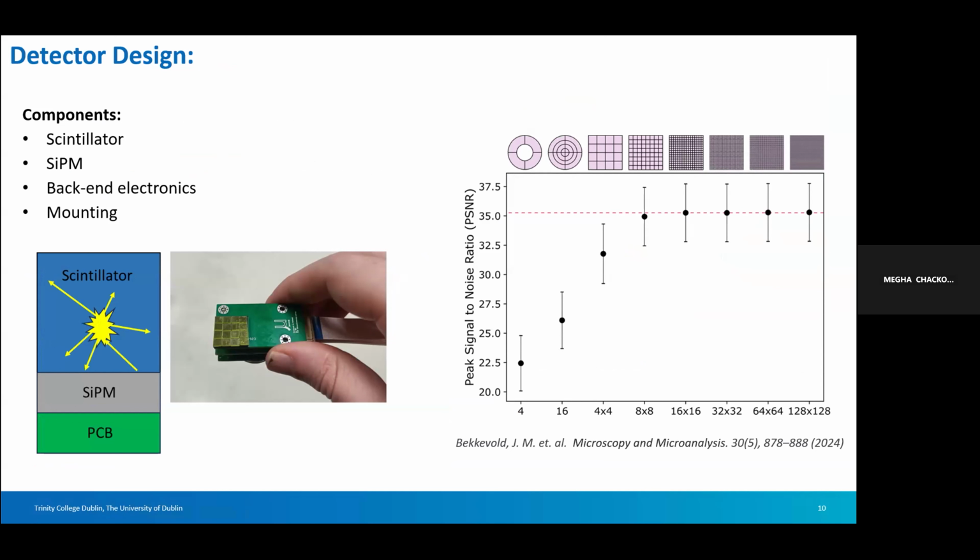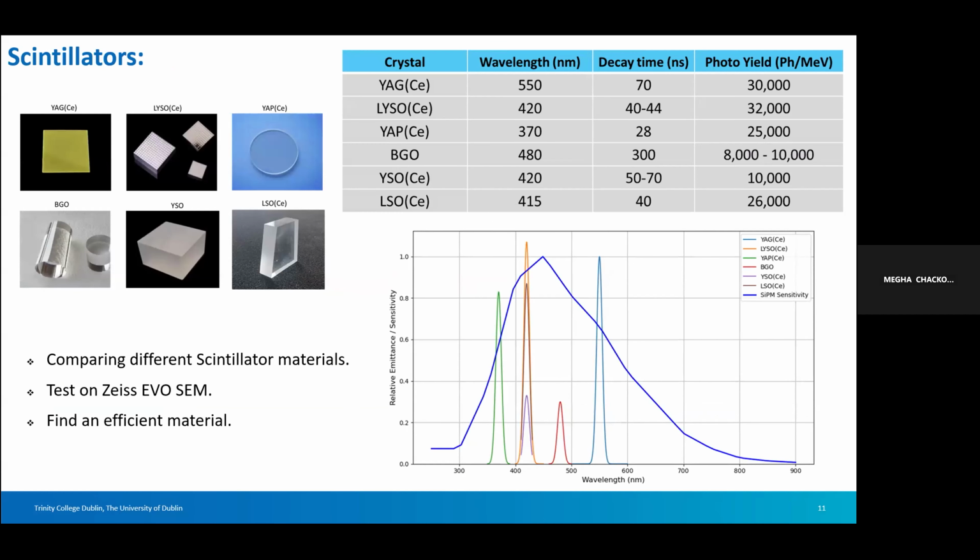Along with the low cost, we also have to consider high-speed detection. So how can I achieve that? As I mentioned, I will be using scintillator-based detectors. For scintillator-based detectors, I have to choose the most efficient scintillator, and I also have to use a silicon photomultiplier for the detection part, and also a PCB design. The choice of scintillator is the most important thing.